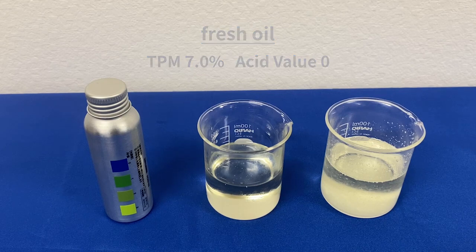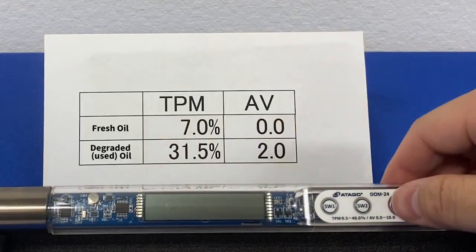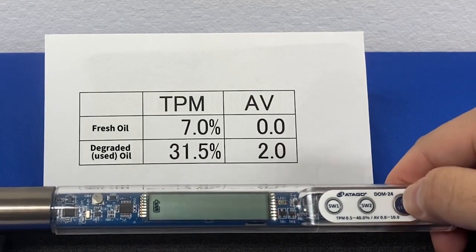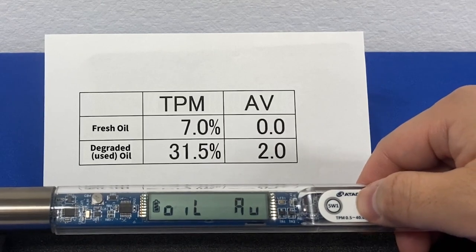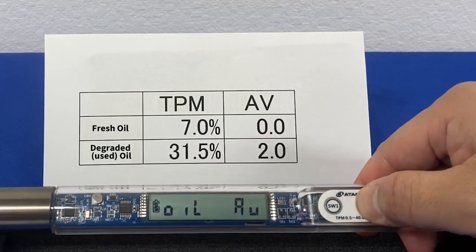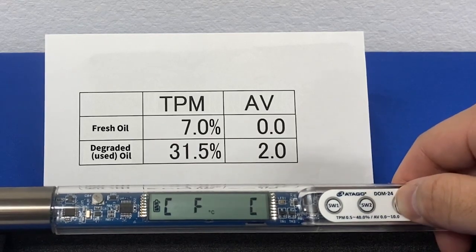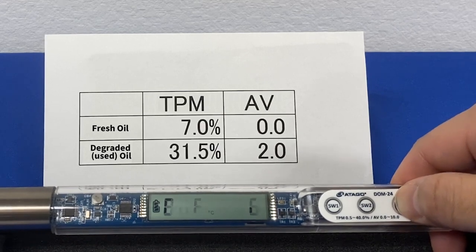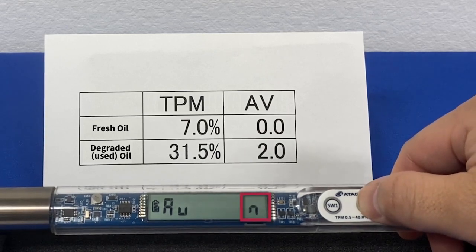Conduct the same test with the degraded oil. Now the measured values need to be entered into the DOM24. First press SW1 and the display will change from 'Oil TP' to 'Oil AV'. From here, press and hold the SW2 button for 3 seconds to move to the settings menu. Pressing start will switch to the backlight setting, then the temperature readout, and then AVN will appear for the acid value setting.